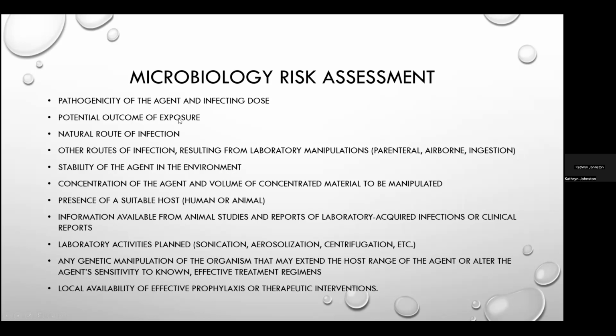And this takes place not only in the microbiology lab, but also in the other areas of the laboratory, because everybody's managing specimens of some type or another. So you need to make sure that this risk assessment is done in all the different areas. So pathology may be a little different than the morgue. The morgue's going to be a little bit different than microbiology. Chemistry and hematology are going to be different than microbiology. So it should be done in all areas within the laboratory.